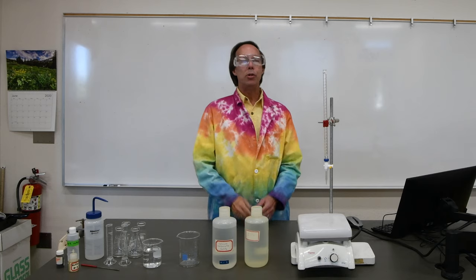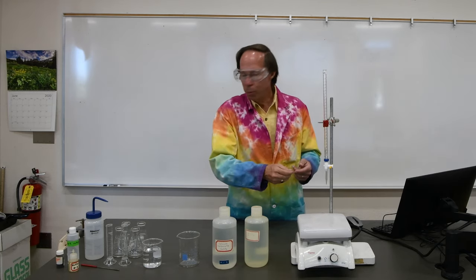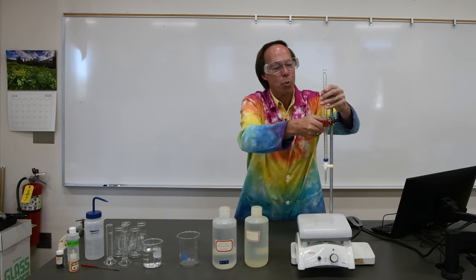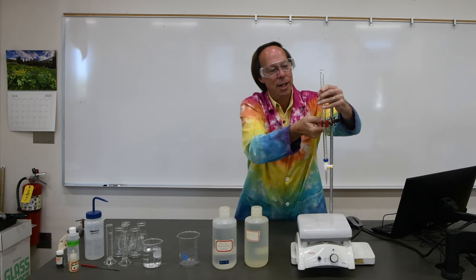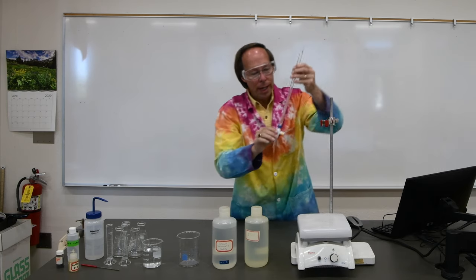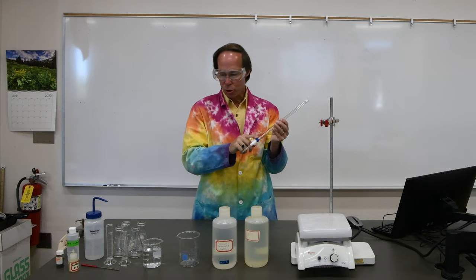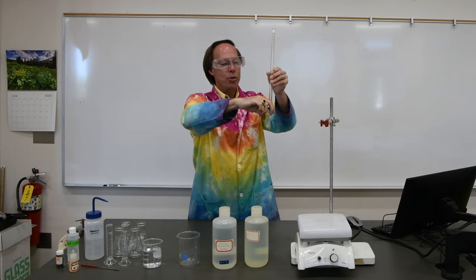The first thing we need to do is to prepare our burette. Normally, we would use a special clamp for this, but I'm going to use just a regular laboratory clamp because it will be easier in this particular case. Now, we can't assume that our burette is clean to start with, so we need to make sure we clean it out. This little device here is called a stopcock.